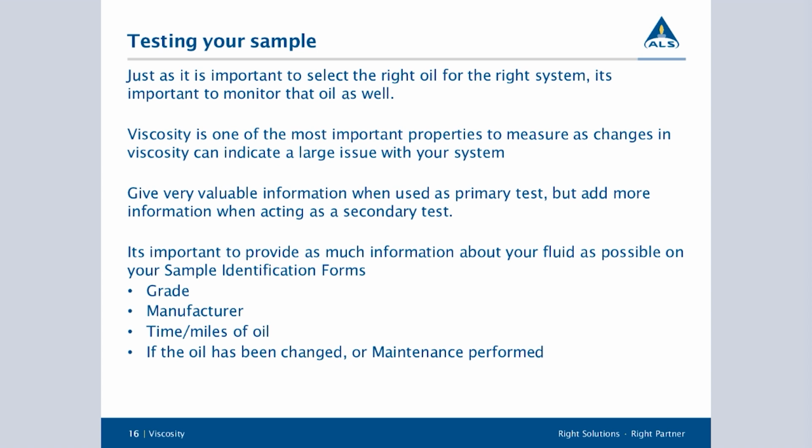But one of the things that I want to touch on and really emphasize as we draw to a close is providing your fluid information on your sample identification form. So when we start to test your viscosity, I've talked about how important a grade is and what it's going to tell you about your information. But if you don't provide that with us, all we can provide you with are your results. You'll get a much better diagnosis if you provide that grade information.